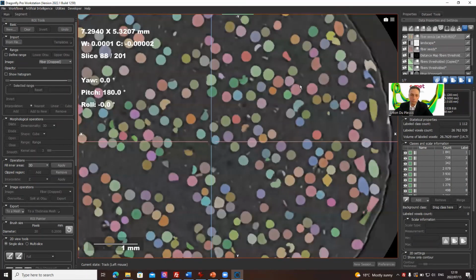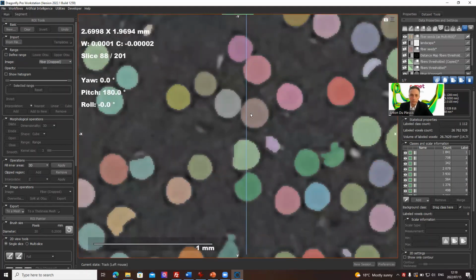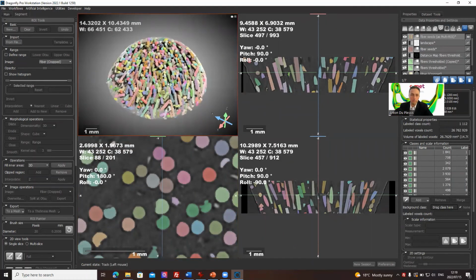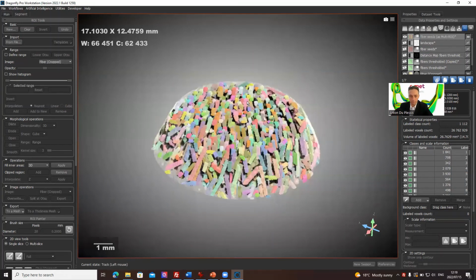we can show that each fiber is separated. There's a good example over there. There are two fibers which were touching before, and at the moment they are separated. So that's quite nice. So now we have a 3D nice fiber separation using Watershed. Now each fiber in this multi-ROI has a separate class, and now you can apply some analysis to these separated fibers.